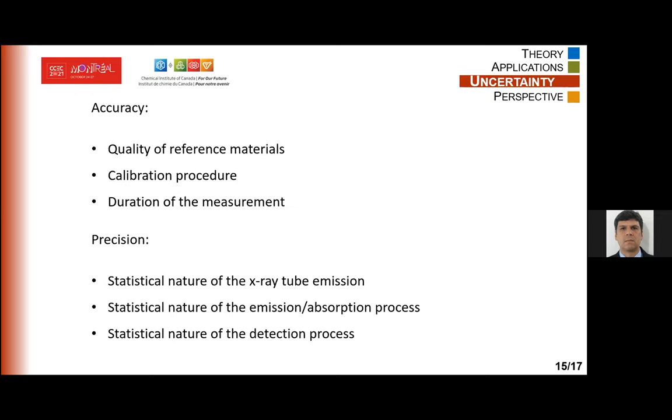And obviously, if you increase the time of the measurement, you will improve your accuracy, because you will have more data, and then you will reduce the systematic error and your statistical error, which is also the precision. This is basically due to the statistical nature of this quantum analysis. So it's related to the X-ray tube emission, the emission absorption process and the transition, and the detection process of the detector.